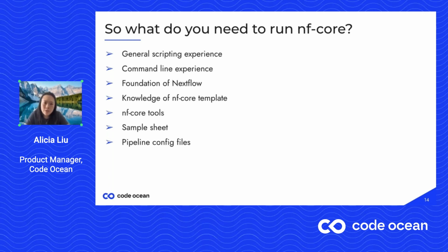Having a foundation of Nextflow is incredibly helpful, and this is definitely something that I did not have. And actually, that's part of what made the whole process a little bit intimidating. There are so many Nextflow training tutorials that you can find them on their website, you can find them on YouTube. If you're interested in learning Nextflow, I think just diving into tutorials and documentation is a good way to go.